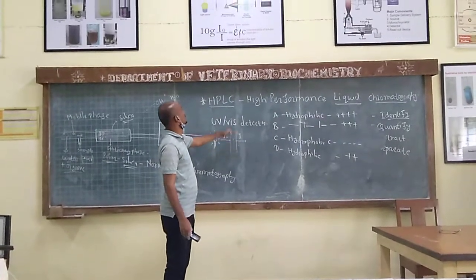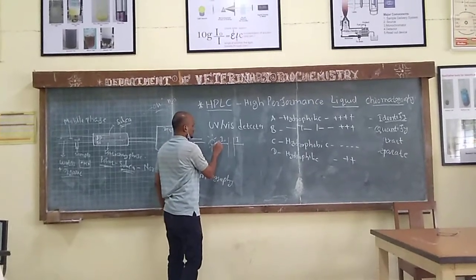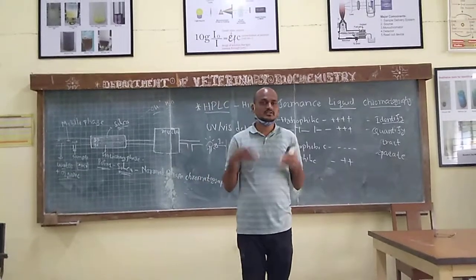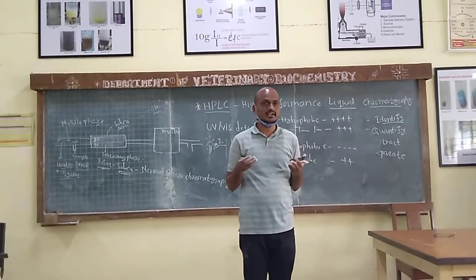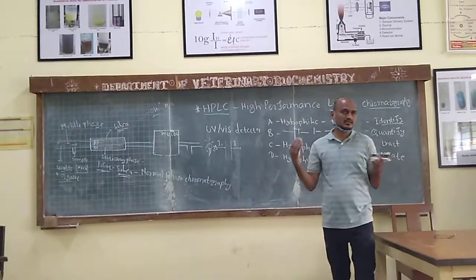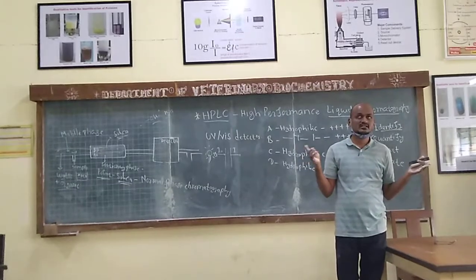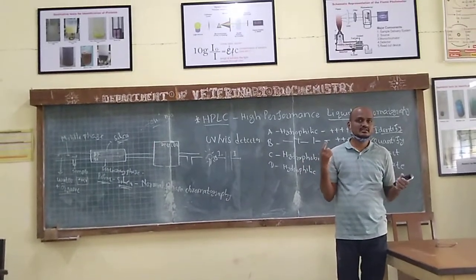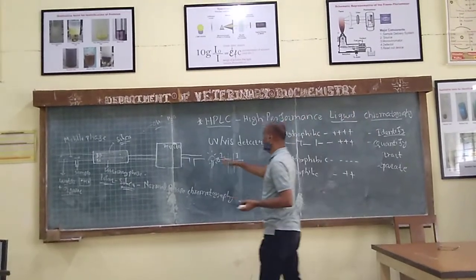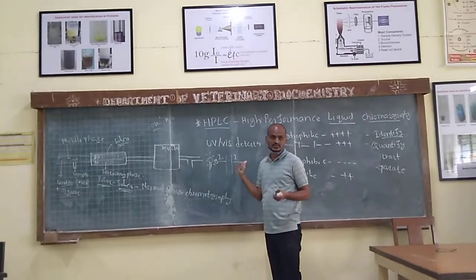We are passing it through the solvent. Okay, so the monochromator is there. Monochromator means, if you are passing the visible light through a monochromator, it will give the 7 colors, like a rainbow. In the rainy season, clouds are there, and a beam of light passing through that cloud will split apart, right? So basically, this white light we see is composed of 7 visible lights. The purpose of the monochromator is to separate the light into individual wavelengths.